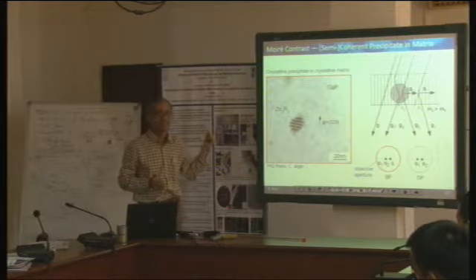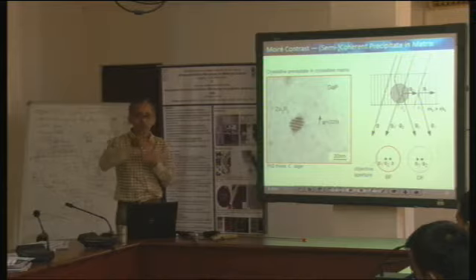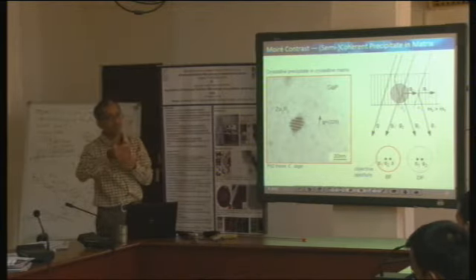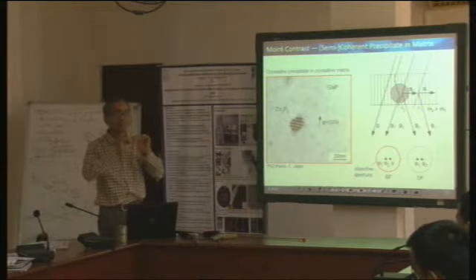Now, why is this done? And this comes to your point: when we do this, we know that all the contrast that we are seeing in the image is coming from the 220 lattice planes, because those are the ones which are primarily diffracting.